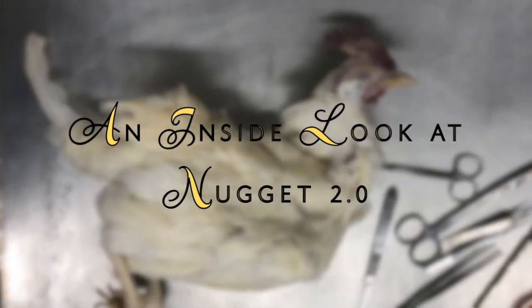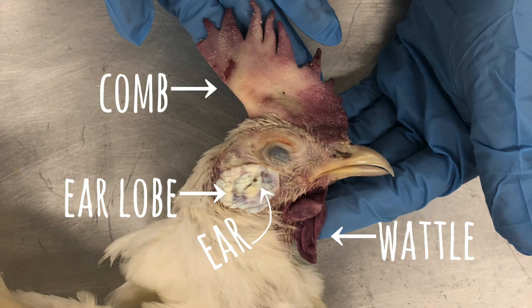Welcome to an inside look at Nugget 2.0. First, we have the external anatomy. Here are the ear and the earlobe. The earlobe is an area of modified skin, and the color of the earlobe predicts the color of the eggs. The combs and wattles are ornamental, and their appearance depends on the species and sex hormones of a chicken. This chicken has a single comb shape.